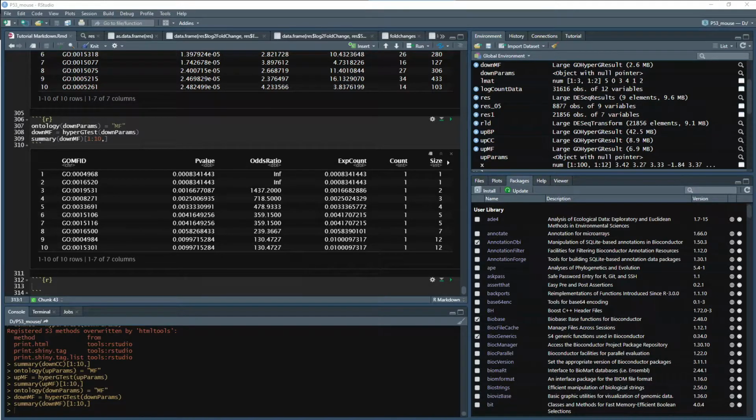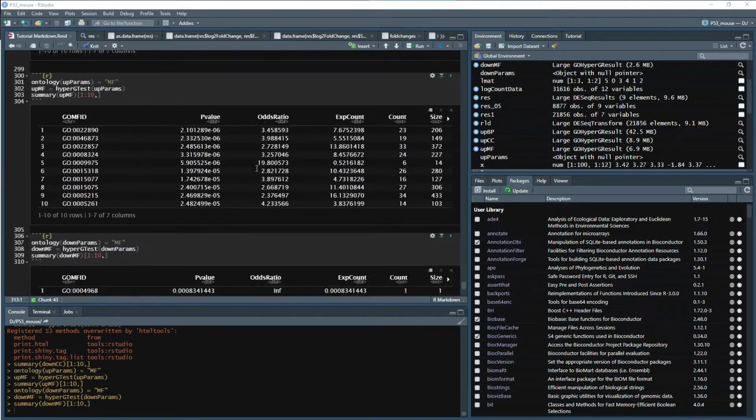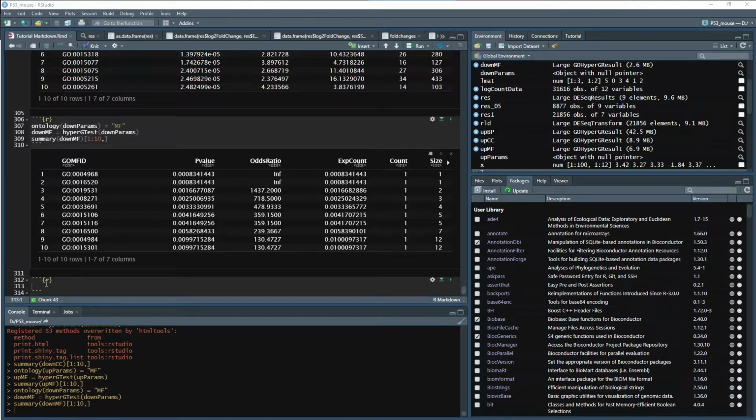So previously we had gone through cleaning all of the data, and then we started looking at the data in R. We visualized the count file that we got output from featureCounts. We did differential gene expression. We did some gene ontology things, which you can see we have left over from last time here. And now today we can go on and look at the gene ontology pathways with KEGG pathways.